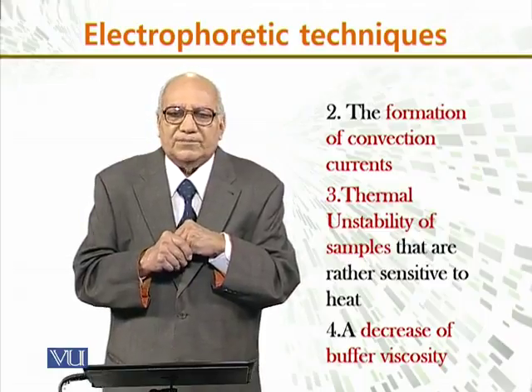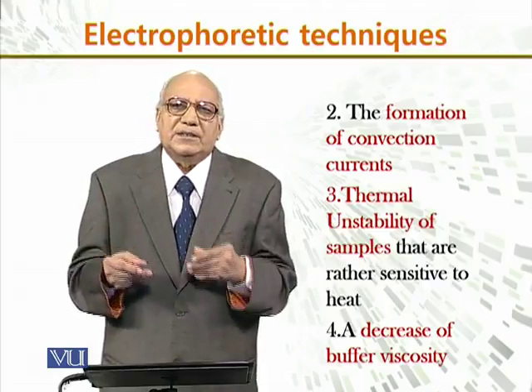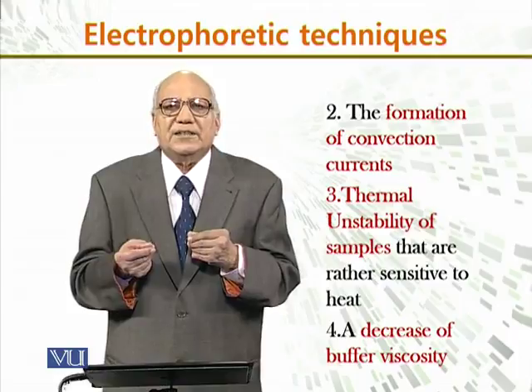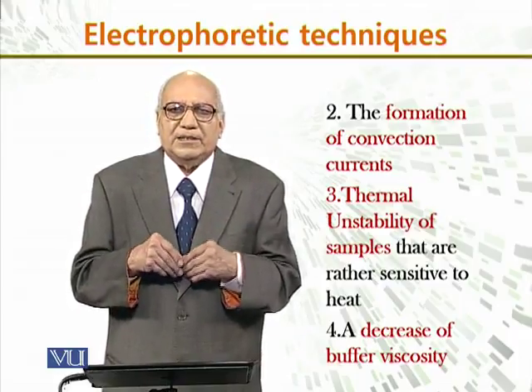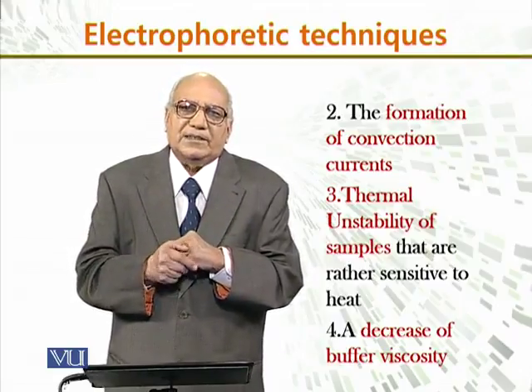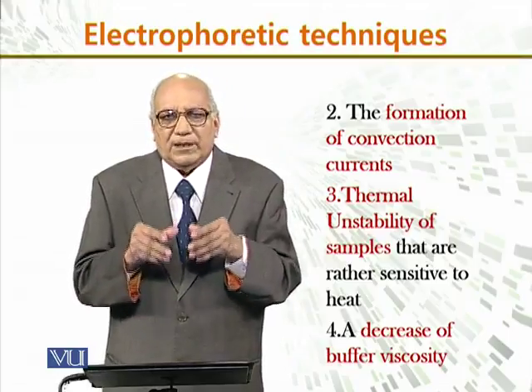And the last is that when the buffer is heated, its viscosity decreases, that is, it becomes less viscous, and this affects the electrophoresis of the molecules.